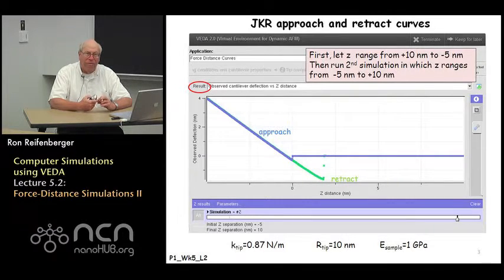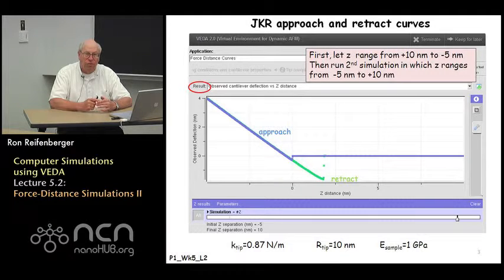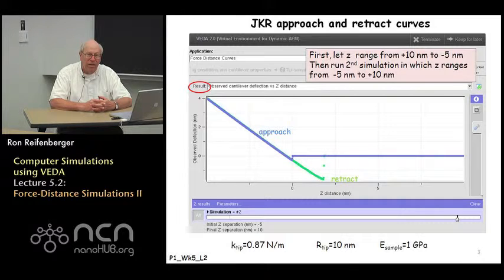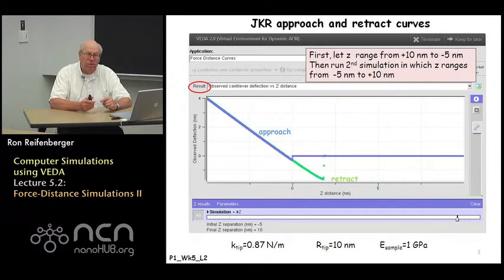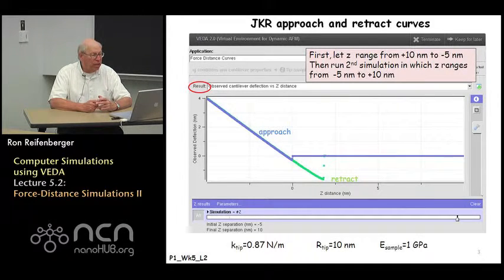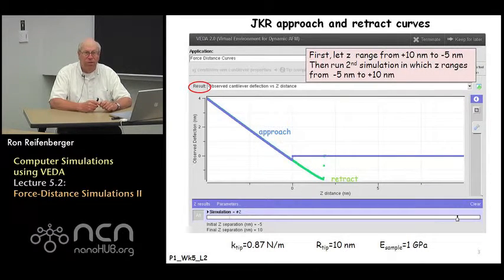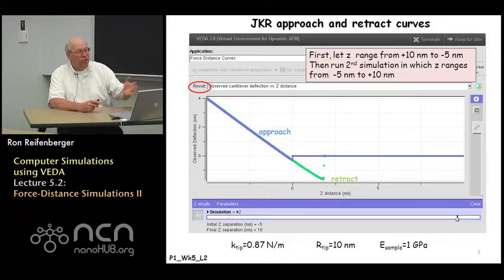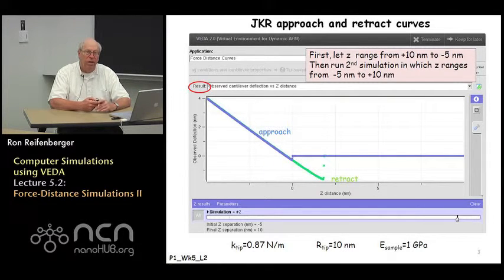There's a bar located across the bottom of the window that allows you to select the different simulations performed in a particular run. The simulations are indicated by small vertical lines, and you can position the cursor on each vertical line to highlight one simulation versus the other. I colored one simulation green and the other blue to allow you to track the approach and retract curves. There's a clear hysteretic behavior, which is what you would predict using the JKR model.